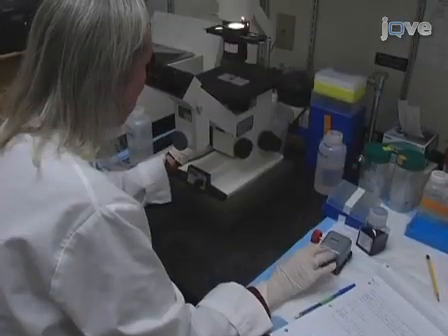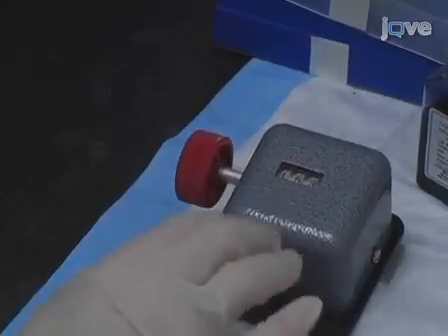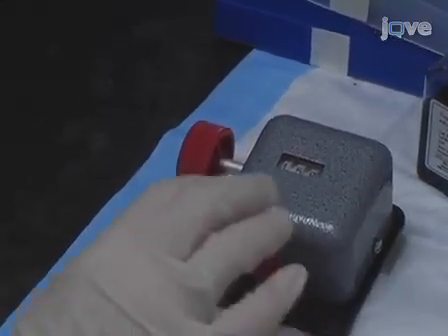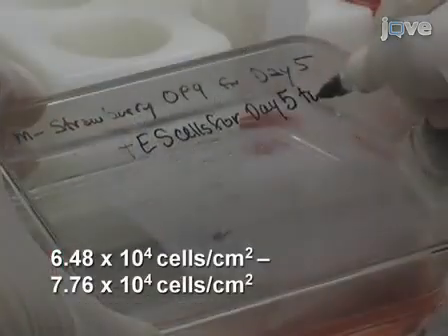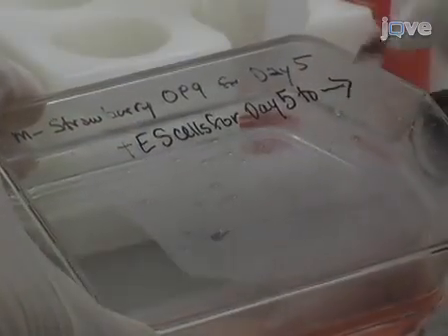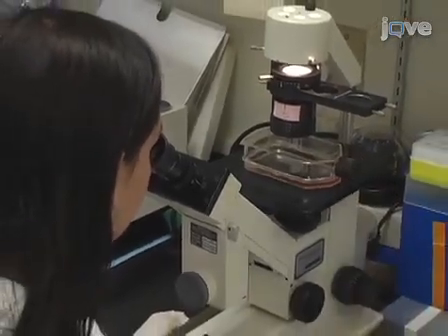Count the cells using a hemocytometer. There should be a 100 to 150-fold increase in ES cell number from day 0. Reseed co-culture cells onto a new layer of confluent M-strawberry OP9 cells. On day 8 or 9 and day 12, count the cells again.